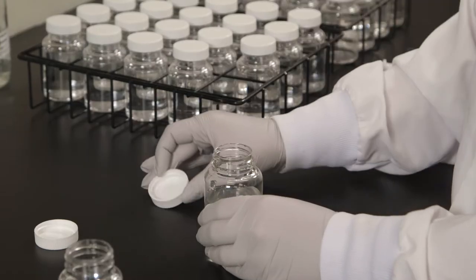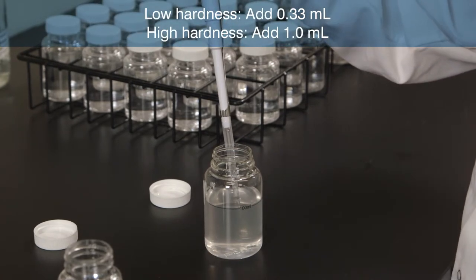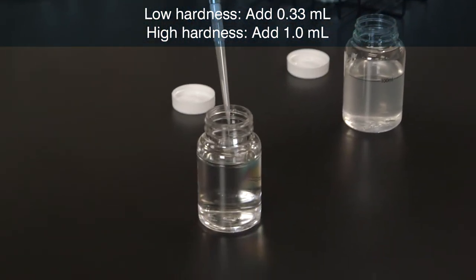Add supplement as follows. For low hardness samples, add 0.33 mL of supplement. For high hardness samples, add 1 mL of supplement.